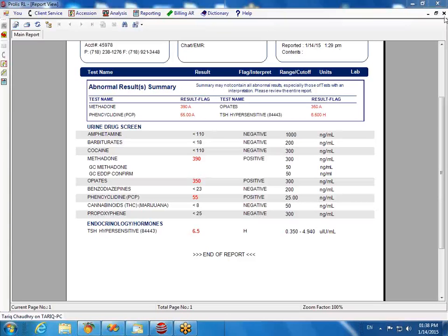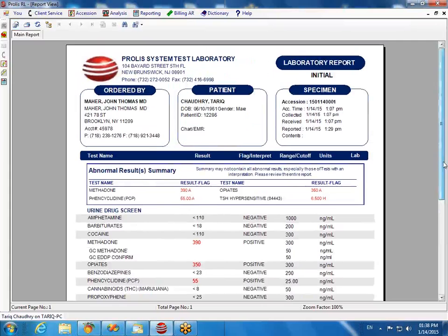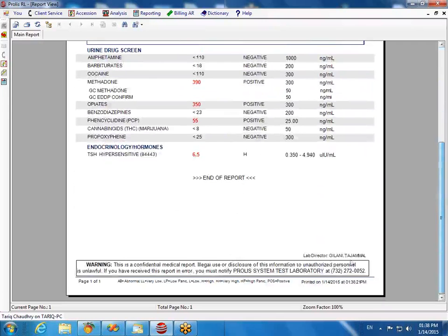Let's make sure we see the report. Can you go back up just to? Okay. I'm sorry. Yeah. Because we have to store hard copies of all of this. With the system you don't need to. Okay, and then of course the laboratory. Okay, where you have the Prolis, we can put the lab director name and all that. It is there. Yeah. Oh, there we go. All right, great. Okay, you got the little legend right here at the bottom.